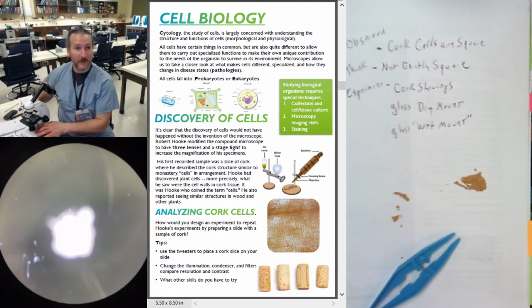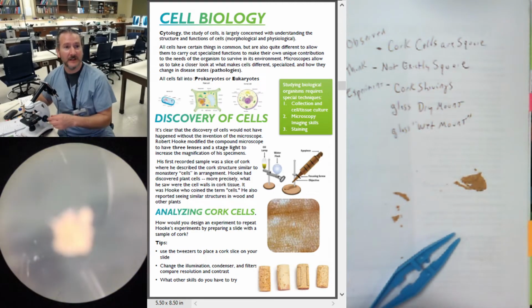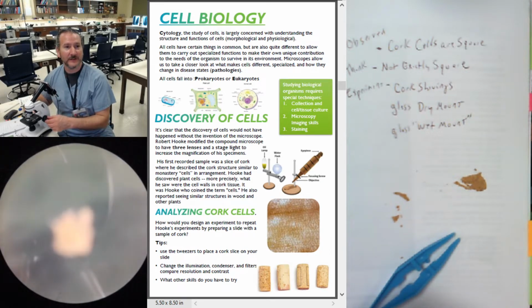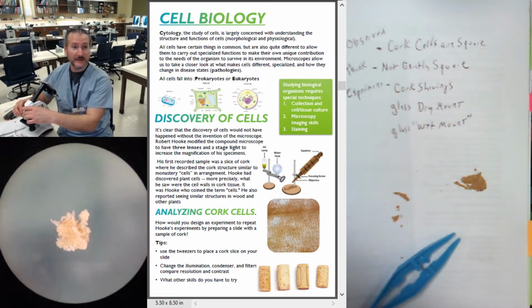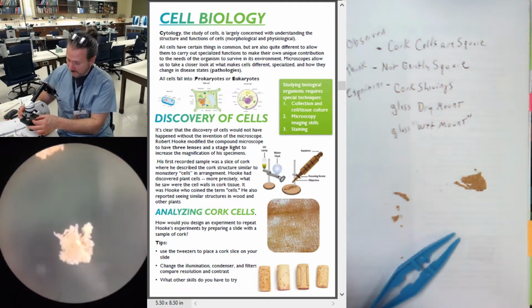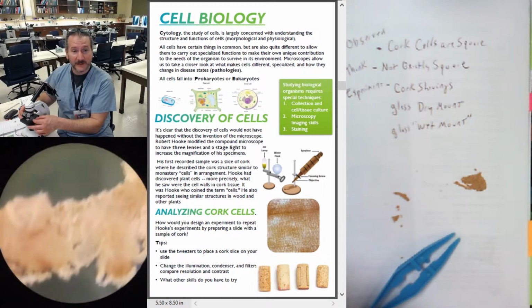I'm going to go back to the surface. Oops, turn that off. Fine focus. Oops, a little too much. Bring it back, bring it back. There we go. And actually, I'm going to move around and find some more pieces, because remember, I had that very thin piece I thought was going to be perfect.